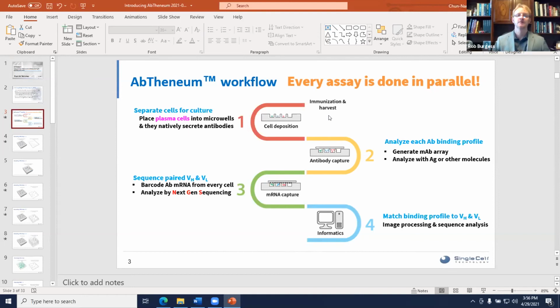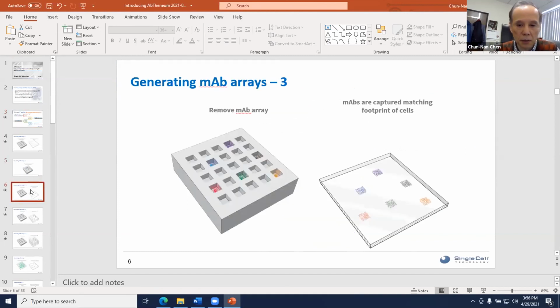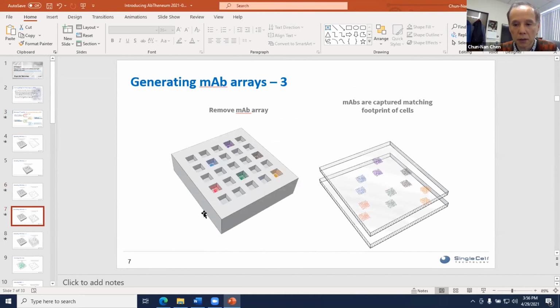Right. And Moen Shayagania has the question, how repeatable is the binding profile? It's very repeatable because we have actually done multiple of those slides, going back here. We have done that with the same antigen.